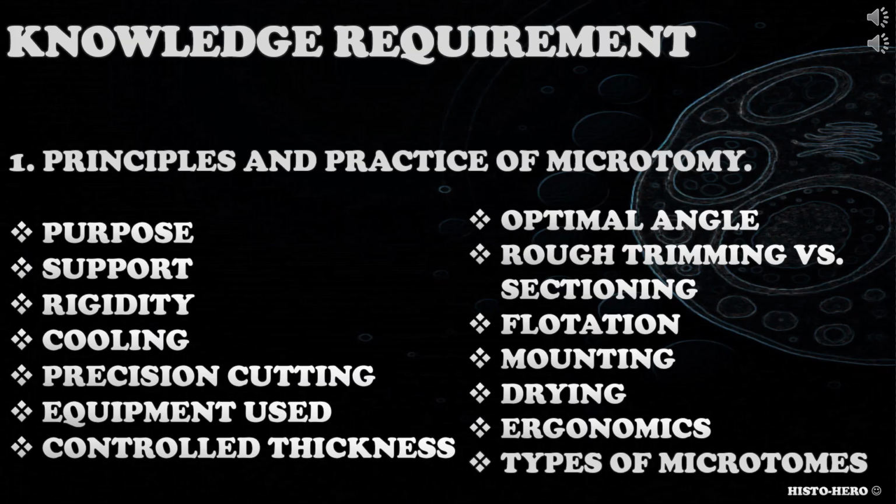The first knowledge requirement is principles and practice of microtomy. Candidate needs to have the knowledge and understanding about the principles and practice of microtomy. You could ask the candidate to explain what microtomy is and what its purpose is, how microtomy is performed, what equipment is used during microtomy and how it needs to be set up, to list types of microtomes.